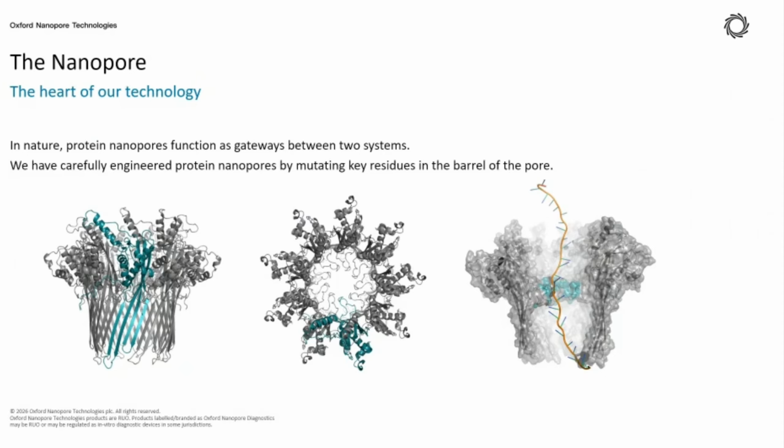Because DNA and RNA molecules carry charges, when they pass through the nanopore, the sequencing device will be able to capture the electrical signal changes while the process is happening. That is why we are able to identify the bases within the DNA or RNA molecules in real time while the sequencing is still ongoing.